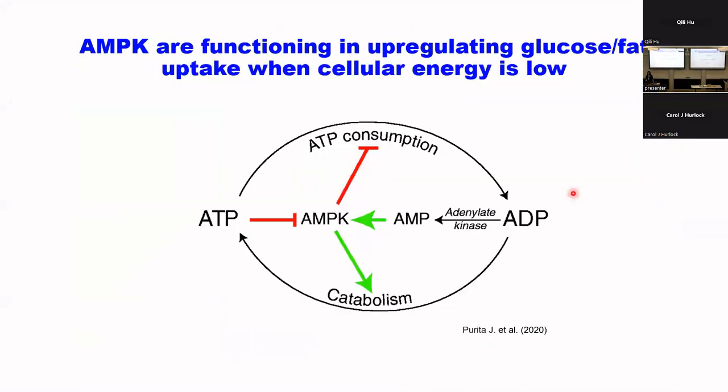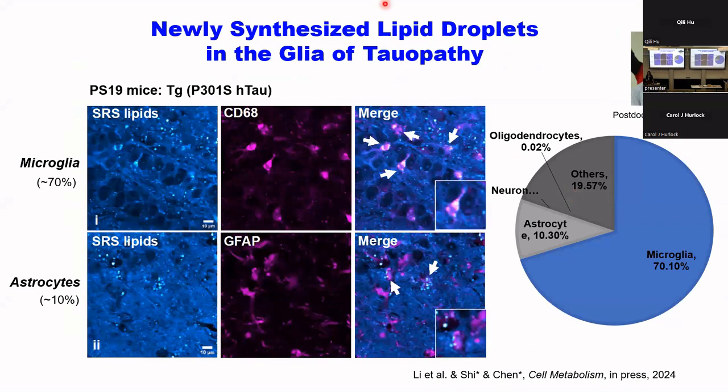And this is really precise for studying even Alzheimer's disease. So how can we study Alzheimer's disease with imaging? First, we want to express a magenta fluorescence protein in a specific group of glia cells. So this fluorescence protein is expressed only in that group of glia cells.